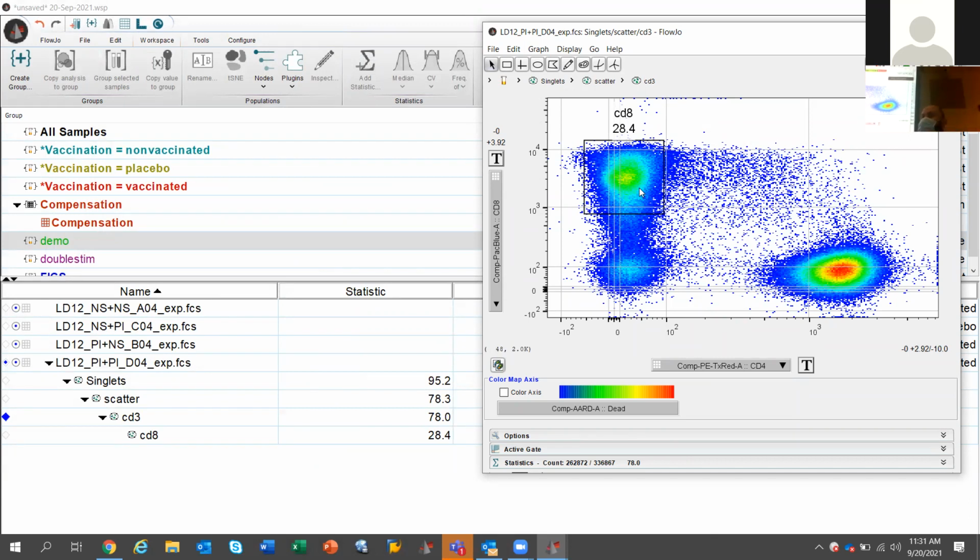Why? Because you're not manipulating the data. You're just zooming in or zooming out. That's why I wanted to create that gate so you could visually see that I am not doing some kind of weird thing to your data. Okay. Now, this is how you see some of those gorgeous figures where everything is perfect in the axis. You just basically zoom in or zoom out.